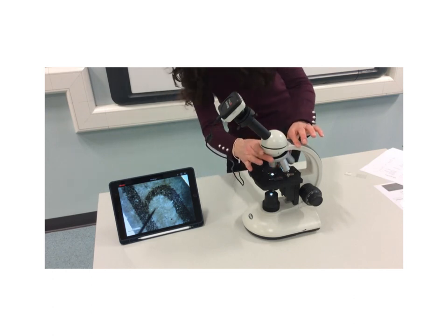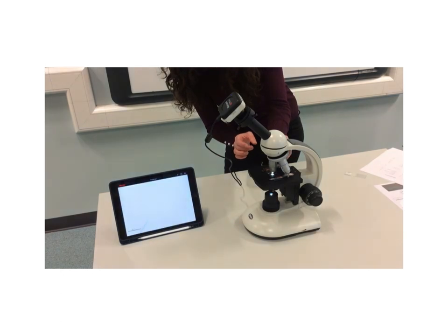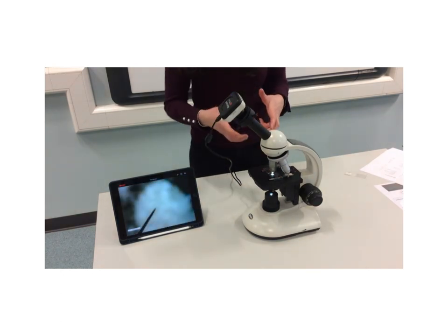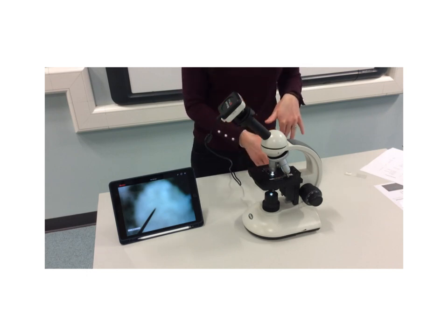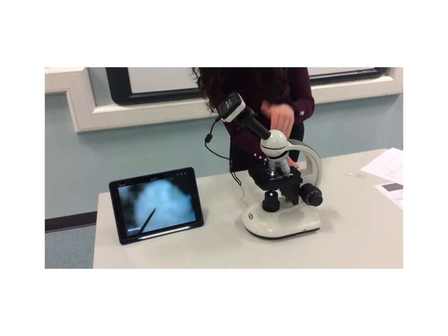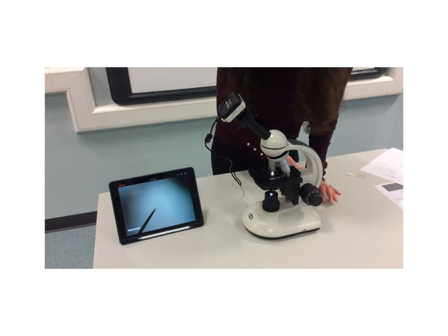Now, let's see if I can put it on to the next lens. We've got to make sure when we're turning that round that again it's not going to make contact. If it does, then again we would make sure that the distance is increased so that they don't make contact. So let's see. Okay, that's as close as they can get now without touching, and let's see if I can get an image into view. Okay, so can you see it there?